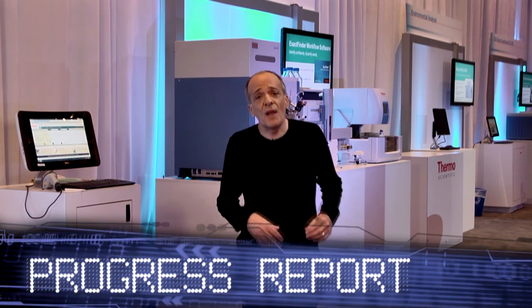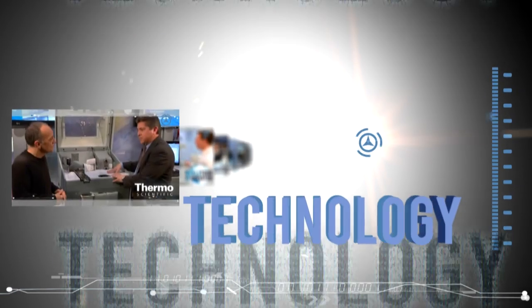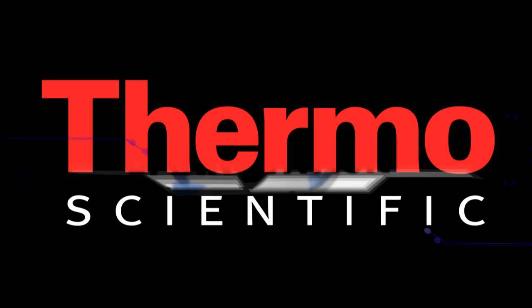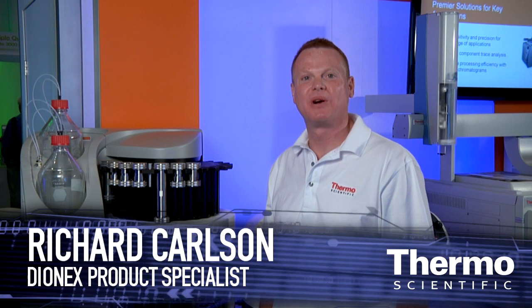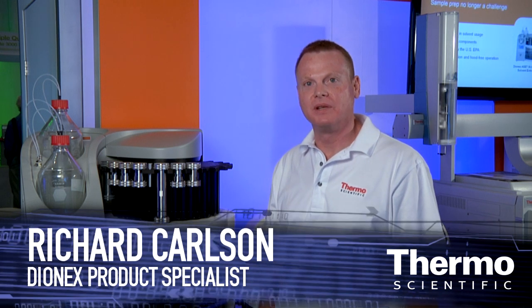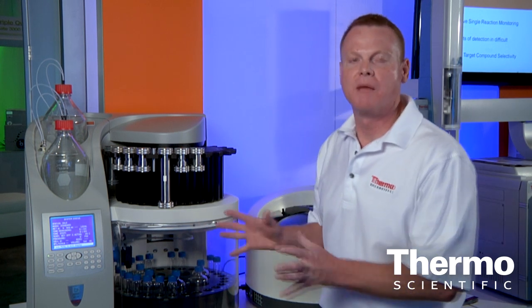We're here at ASMS in Denver, Colorado with new technologies to solve your toughest analytical challenges. My name is Rich Carlson from Thermo Fisher Scientific and I'd like to talk about the Dionex ASE, or Accelerated Solvent Extraction System. The unique thing about the ASE system is that it rapidly extracts solid and semi-solid samples and prepares them for chromatographic analysis.